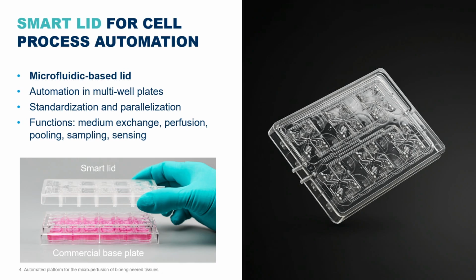The example that you can see here on this picture is a smart lid that was developed for the 24 well plate format and that enables automated medium exchange. Thanks to the inlet and outlet port, we can remove half of the medium in the cell culture and then bring in a new medium in all wells at the same time, thereby automating the medium exchange without having to remove the lid during the cell culture.